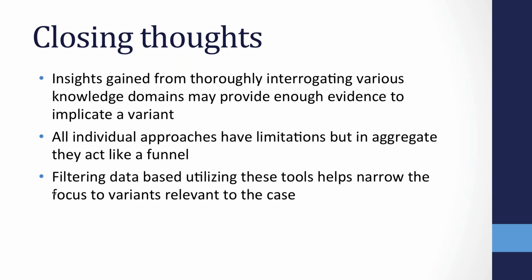So, just closing thoughts here: we really gained a lot of insight in how to interrogate this genomic information. And ultimately, there are a lot of tools and a lot of domains that we can utilize that can give us evidence to implicate a variant in this type of case.